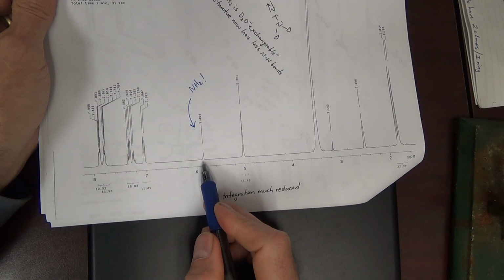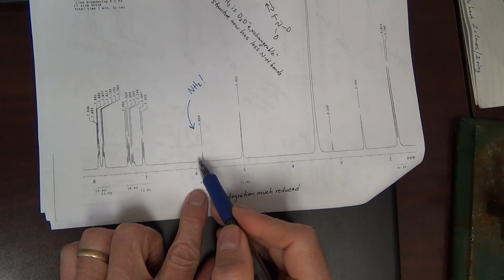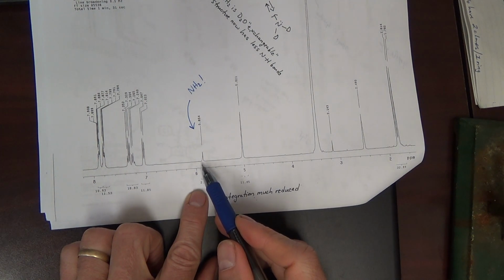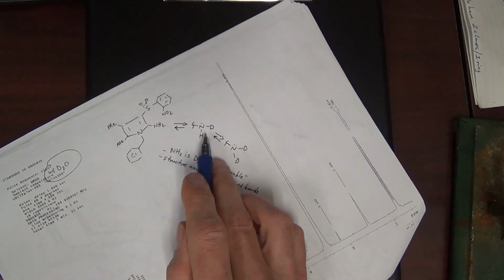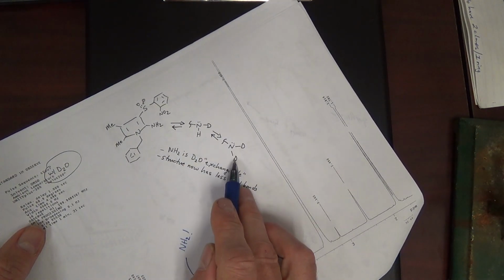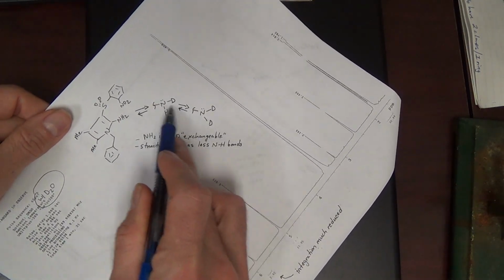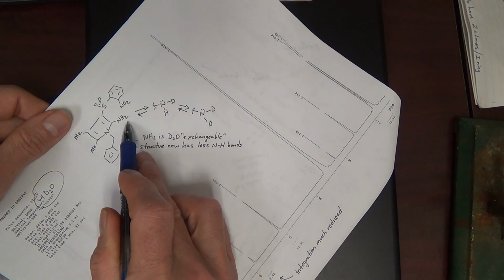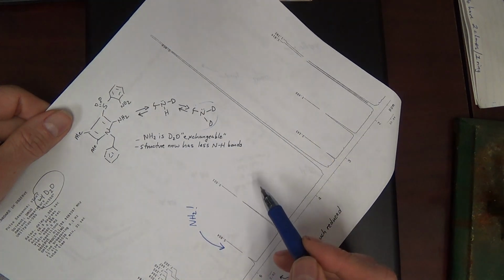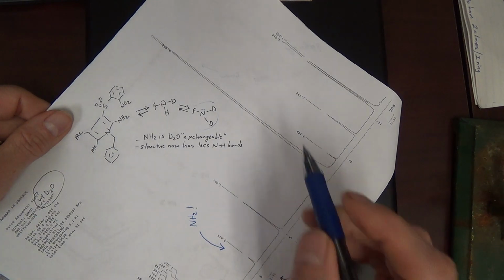It has diminished in size. The integration is no longer the same. This is integrating much lower. Why? Because the NH2 exchanged with deuterium. Now if it's NH2, it can actually exchange once and then it could exchange again. But we have removed H from the NH2, and if it exists like this, there's going to be no signal at all. Basically, an equilibrium is set up like this depending on how much D2O you add.